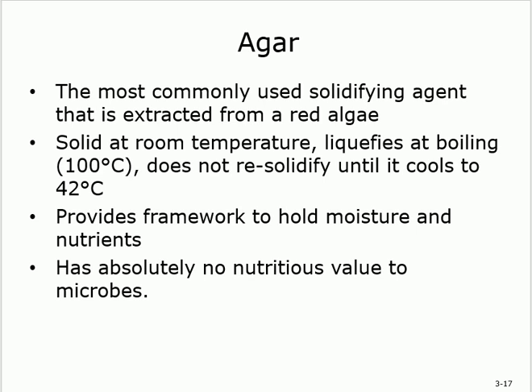This is agar. I add it to the medium. What exactly is going to happen? Can I play with the physical state? Can I change it? Yes, you can. How? If you increase the temperature to 100 degrees centigrade, okay, it will become liquid. And if you put it towards 42, it will become solid. So under room temperature, it is solid. Can I liquefy? Yes, put it in 100. Can I solidify again? Yes, put it in 42. So these are three: room temperature, 42, 100.